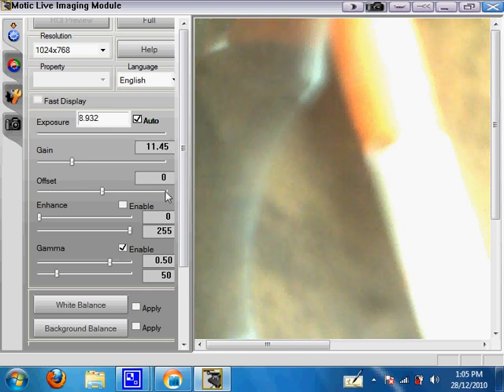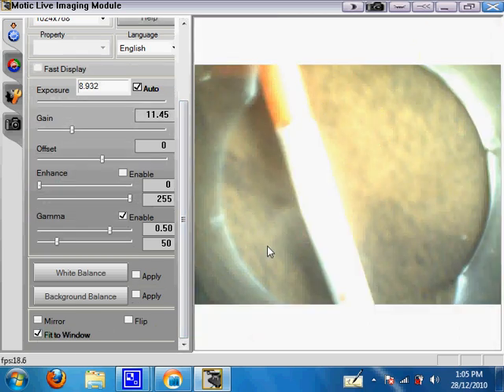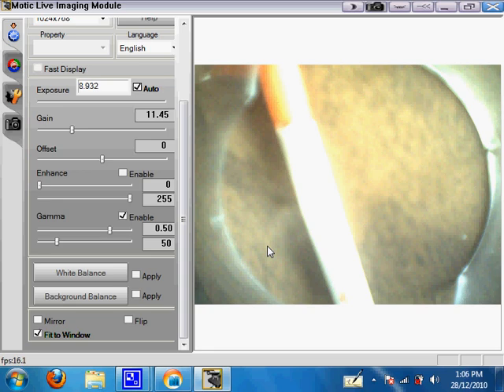What I need to do to get a picture now is just to click on Auto Exposure. I cleared out my picture a bit. And also to click on Fit to Window so I can see all that's in view. Right now, I have my Motecam 2300 looking at a pin.